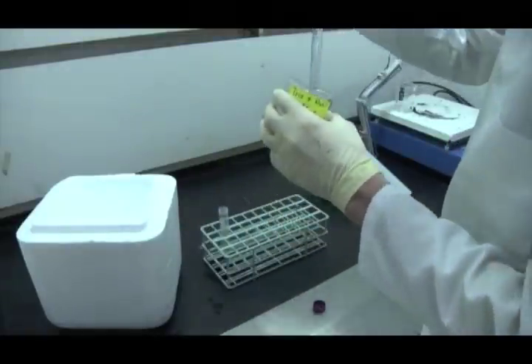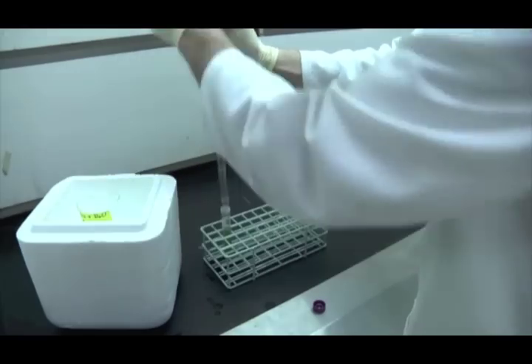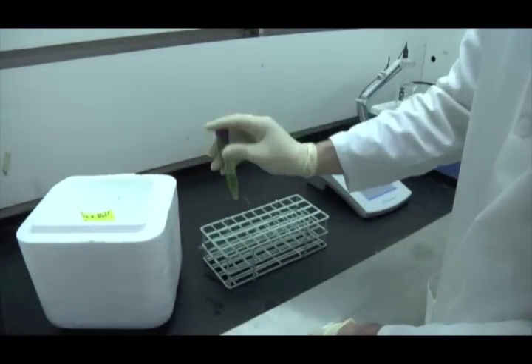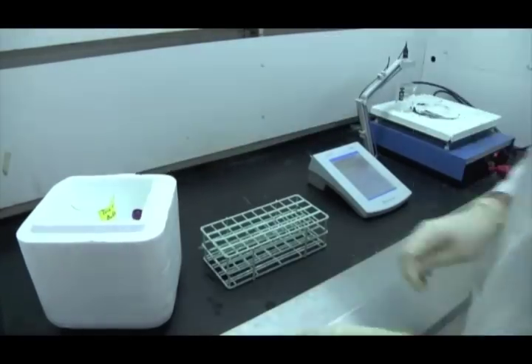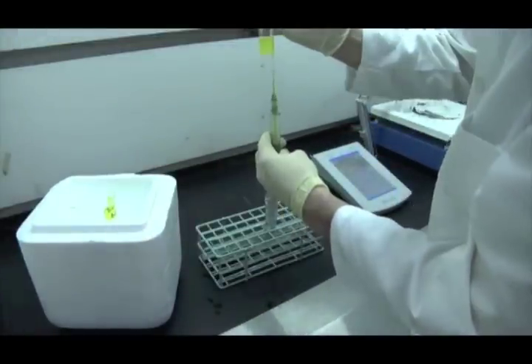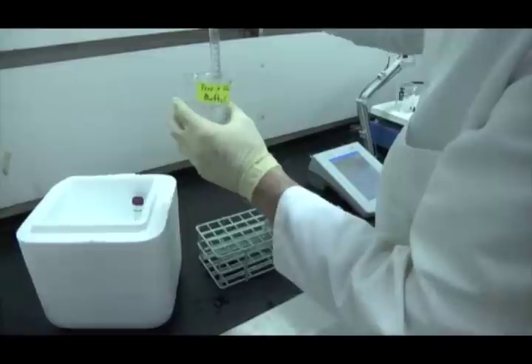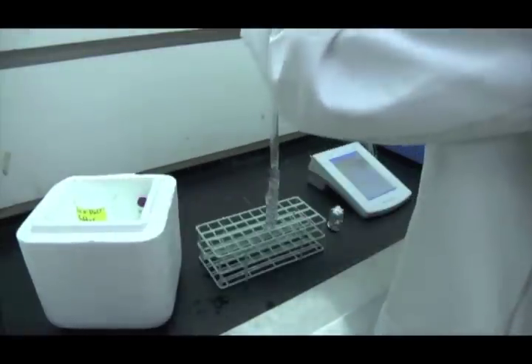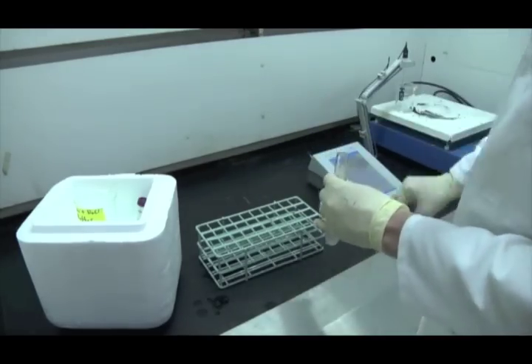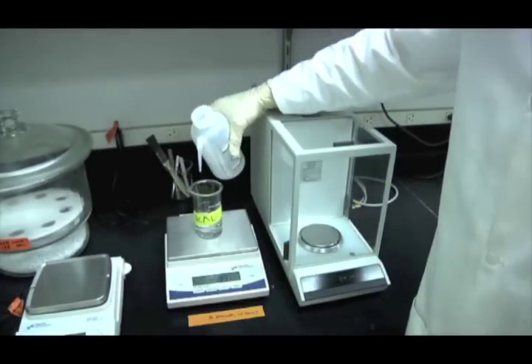The isolated chloroplast fraction is then resuspended in 10 milliliters of the tris NaCl buffer. To maximize solution uniformity, the centrifuge tube is sealed and inverted several times, then returned to the ice bath. The chloroplast solution is then diluted by combining 4 milliliters of chloroplast solution with 6 milliliters of tris NaCl buffer in a test tube wrapped with aluminum foil to prevent the incident exposure of the extracted chloroplast to light. After adequate mixing, the diluted solution was returned to the ice bath.